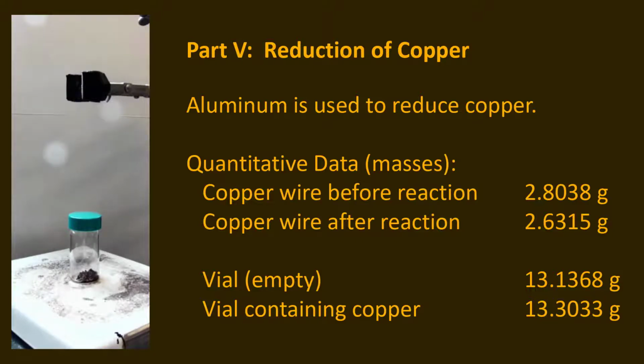And so it has a lot of exposed surface area that could potentially oxidize, which would make it hard to weigh quantitatively. And so the question is, how do we get it dry so that we can weigh it and at the same time not oxidize it, and change it to some other substance?